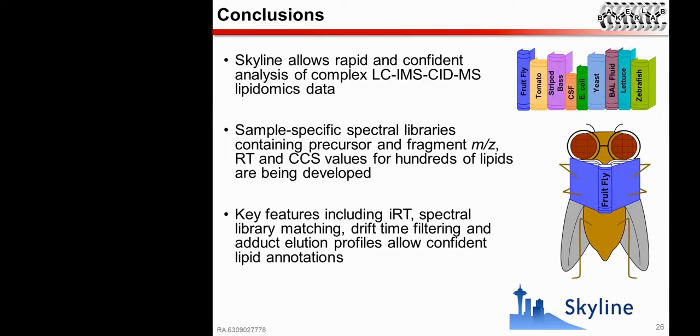And I'd also like to mention here that Skyline has lots of other features outside of what I've discussed today, and they're always adding some new functionalities to their software to make it useful for really any data analysis workflow. So I highly recommend checking it out and seeing how it can fit into your data analysis workflow.